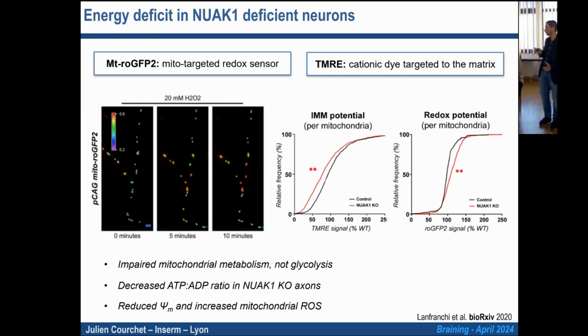And again, one of the beauty of those biosensors that are genetically encoded is that because everything is based on DNA converting to protein, you can add whatever addressing sequence you want in front of your protein. So you can put those biosensors with mitochondrial targeting sequence and look at single mitochondria one at a time.